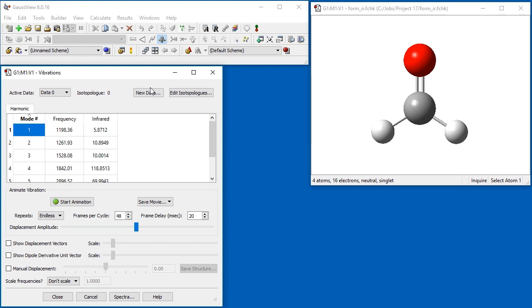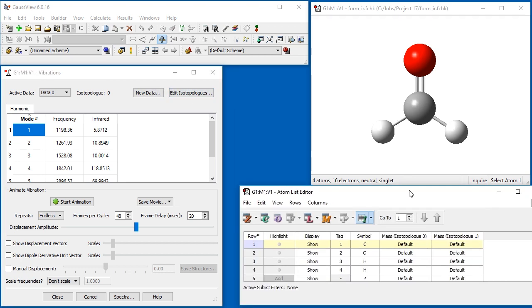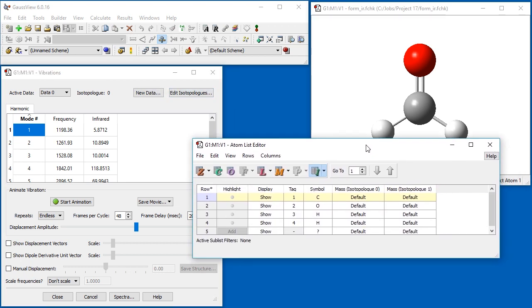By default, isotopologues 0 is defined as a set of isotopes specified for the calculation, which are usually the most abundant isotopes. We click the Edit isotopologues button to define an additional isotopologues. This opens the atom list editor with the isotopes feature active.